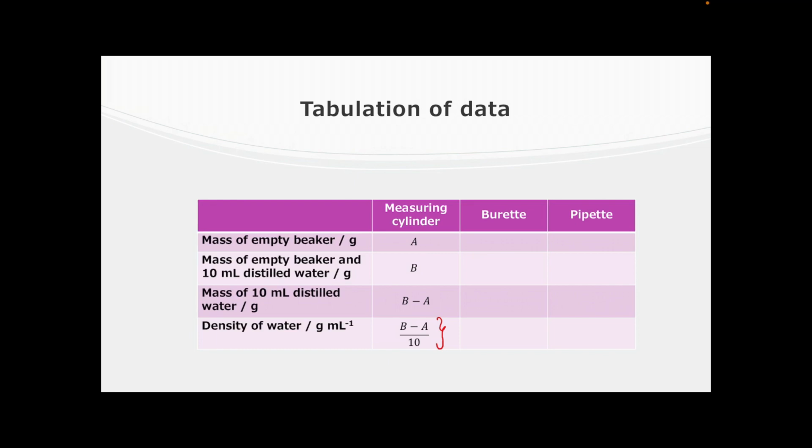After the calculations of the density, you can compare which apparatus gives the most accurate value by comparing the value obtained here with the theoretical one. The nearest to the value indicates the most accurate apparatus in measuring the volume of water.